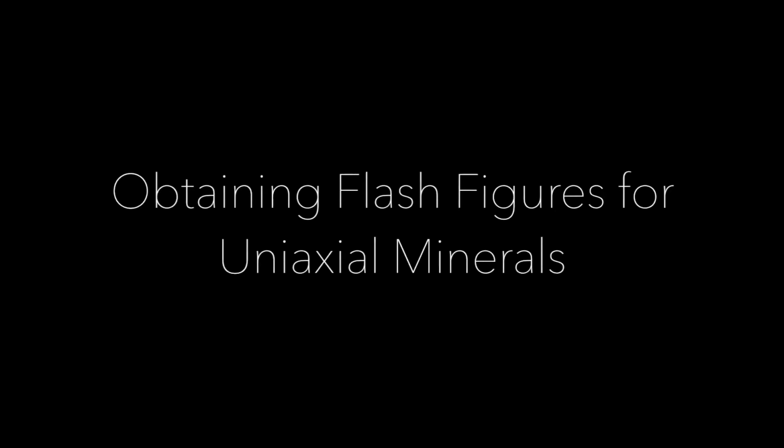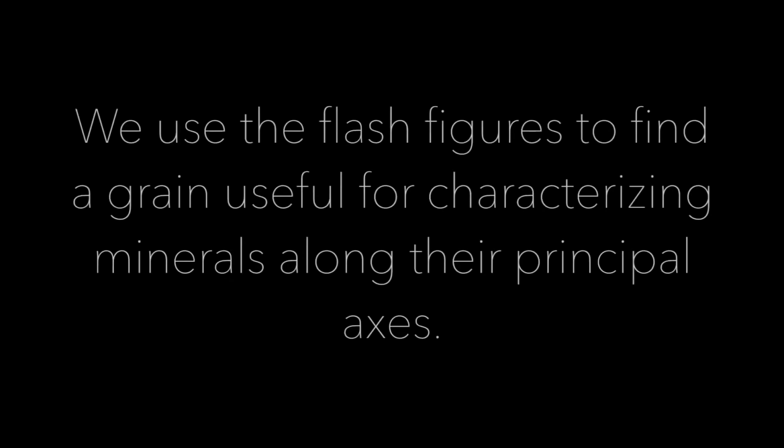Today we are learning how to obtain flash figures for uniaxial minerals. We use the flash figure to find a grain useful for characterizing minerals along their principal axes. In the first part of the video, I will explain the principal axes, and in the second part of the video, I will explain how to find a flash figure and use it.